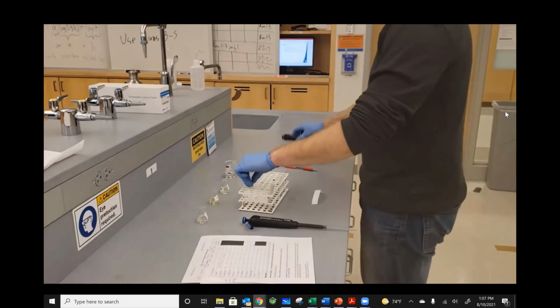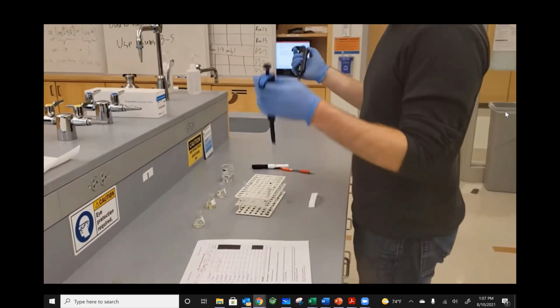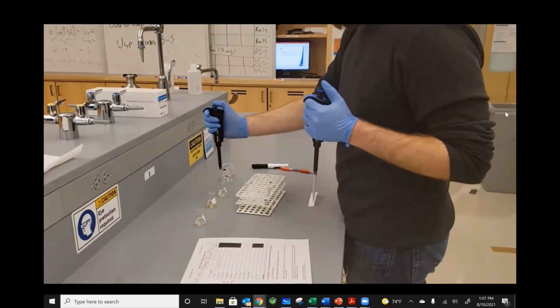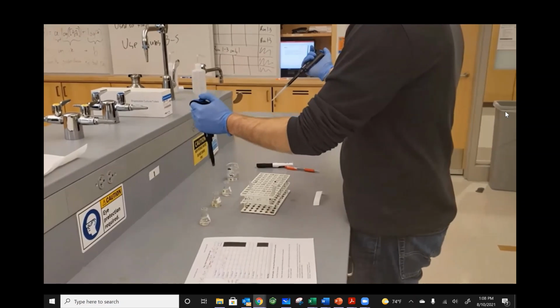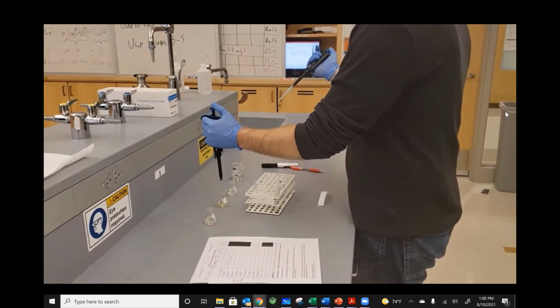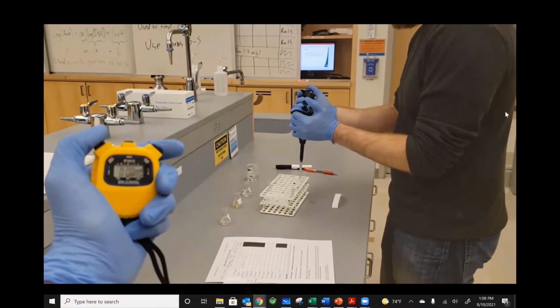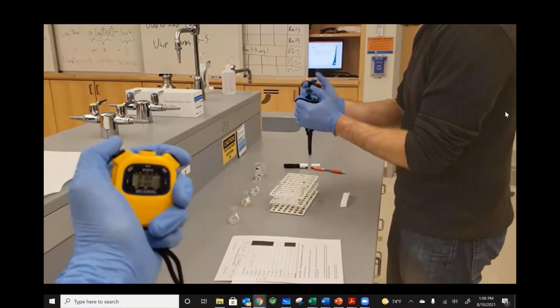Don't ruin your experiment. So this is for my sulfur compound, and this is for my hydroiodic acid. I'm going to collect first my sulfur compound here. Now I'm going to get my hydroiodic acid in this. Now I'm going to be adding these rapidly and then beginning agitation. So as soon as I say go, start the timer. And go.